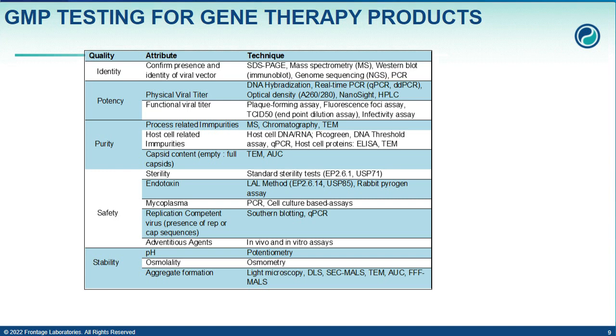And stability usually includes pH, osmolality, aggregation formation, and sometimes cell-based potency for the stability program.